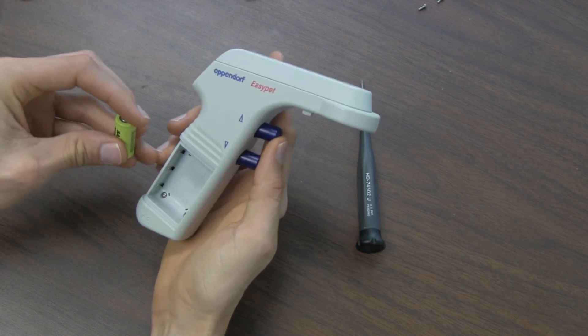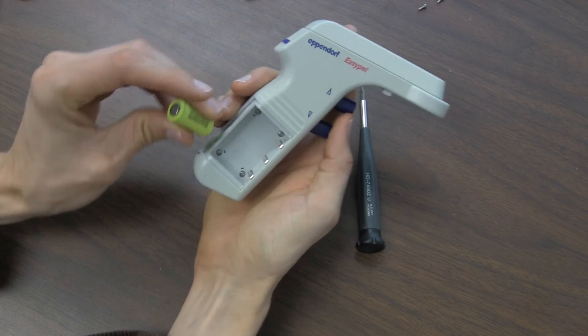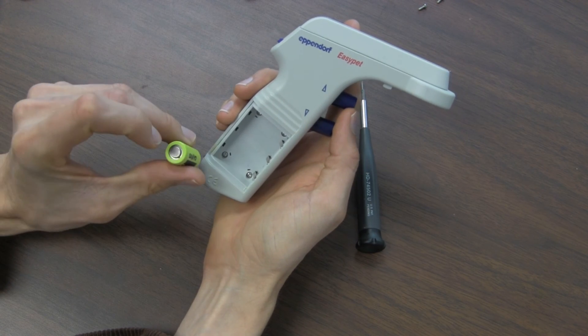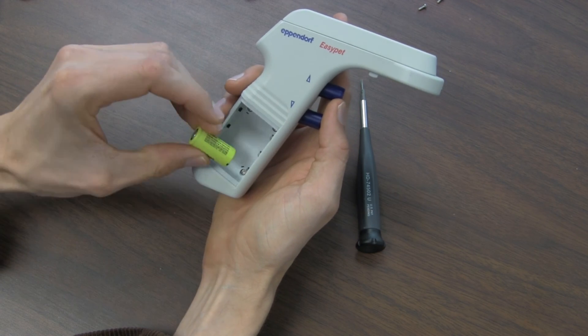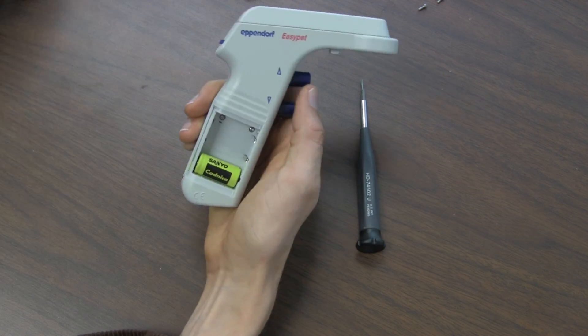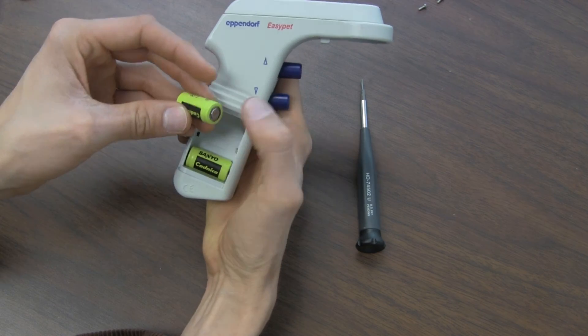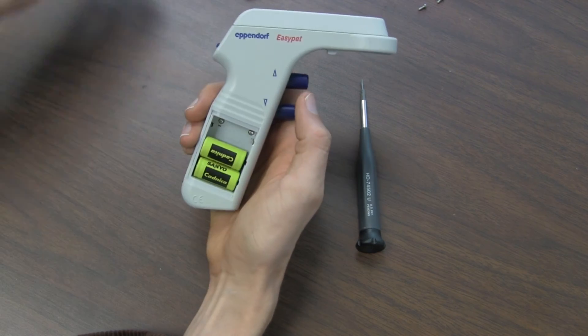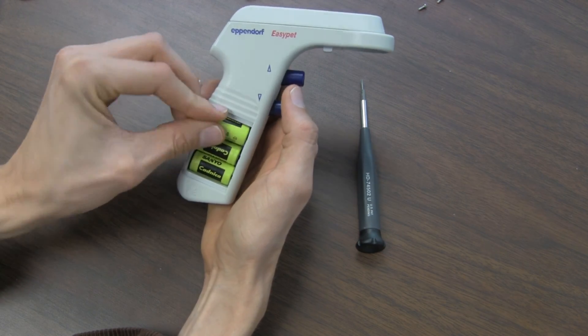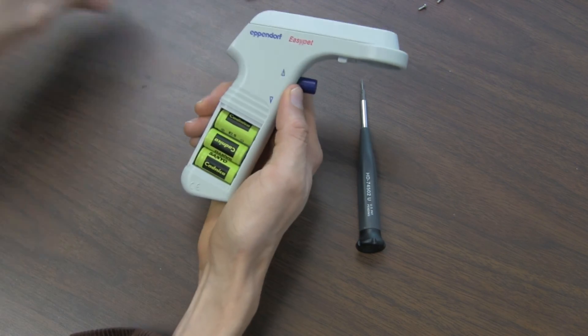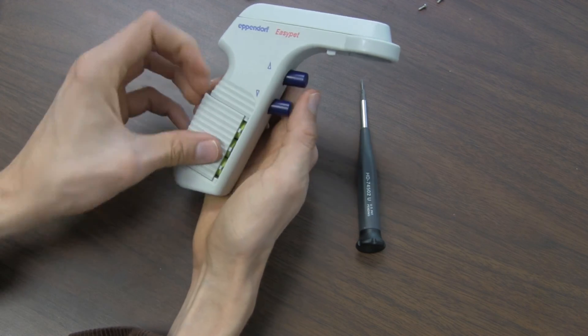And then you can put the batteries back in. Make sure that you look at the polarity in here. This small tip goes on the left side for the bottom one, on the right side for the middle one, then on the left side again for the top one. And put the battery compartment back on.